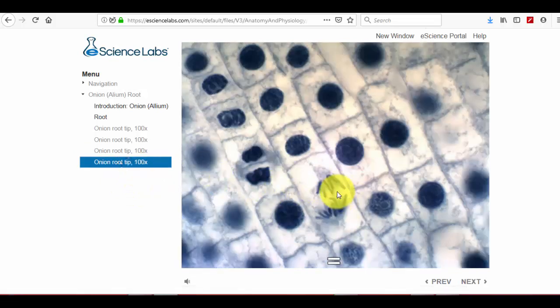Okay, you do this in lab. So there's a nice little telophase right there. There's a metaphase. Some of these, just kind of scanning around. That looks like a prophase. Can't really get that wrong either.